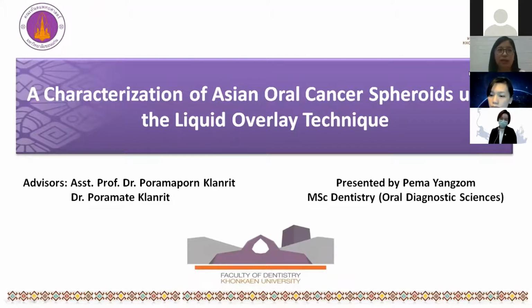But since it shows a diminishing pattern or just remains constant, I checked the viability, as I've shown in my future work, because it was diminishing in size. I was thinking maybe it developed a necrotic core and was decreasing in size, but even when I observed the viability on day 7, it doesn't have dead cells. So it's still viable at 7 days.